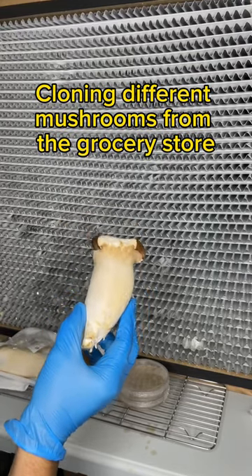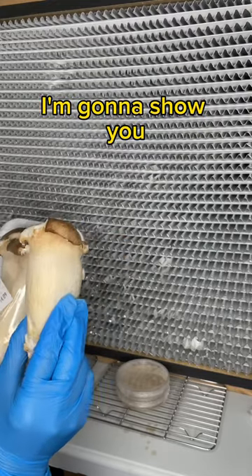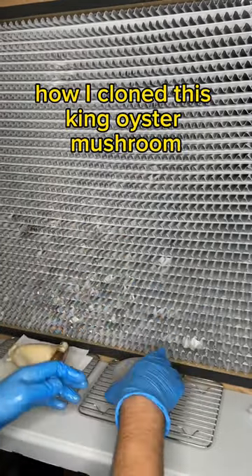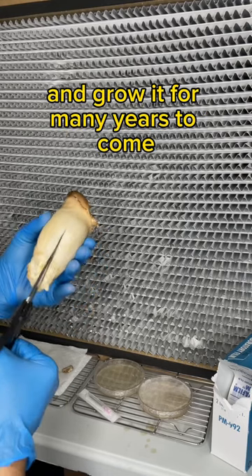Cloning different mushrooms from the grocery store is one of my favorite things to do. In this video, I'm going to show you how I cloned this king oyster mushroom so that I could save the genetics and grow it for many years to come.